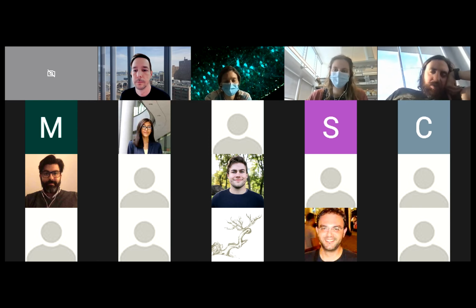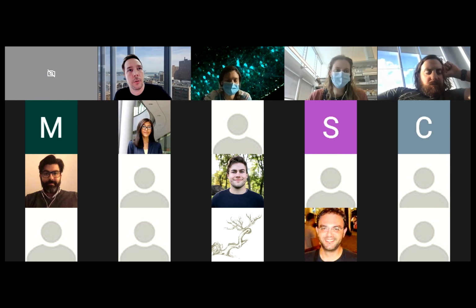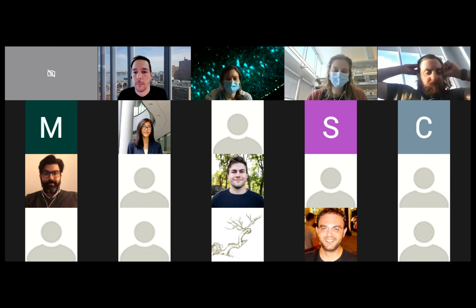Yeah, and the last thing is, I have some anterograde tracers that use synaptic markers, so you're getting dots, and I'm wondering what the best way would be to use that as the projection information. Yeah, if you've got enough resolution to see them as discrete points, then you could almost treat it like a cell analysis. Yeah. And if you had to have more resolution, it's definitely going to take longer for processing, but it could be treated as a cell analysis problem. Yeah. Okay, that was all. Thanks. Yeah, no worries.